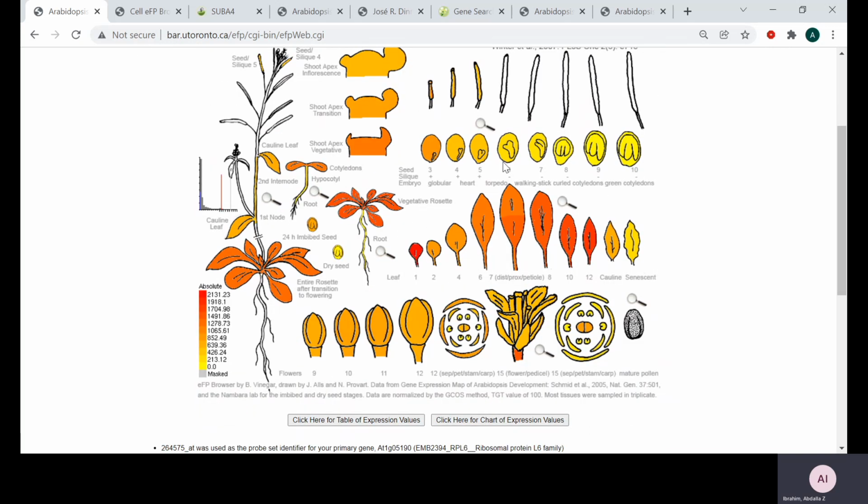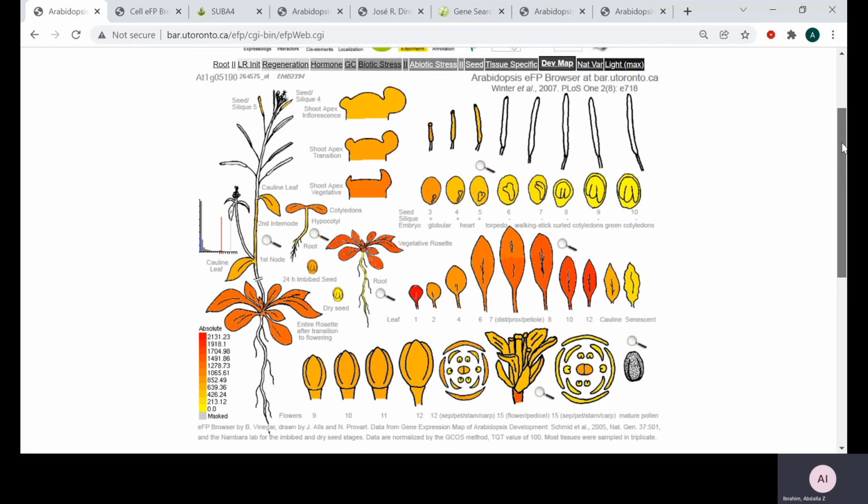They don't really mean anything. The maximum here is 2000, but it could be 3000, it could actually go up to 48,000. This is the maximum gene expression on the chip that was used. So if this number is between 0 and 50, you can ignore these, right? Because it's just noise. It's not really a signal.